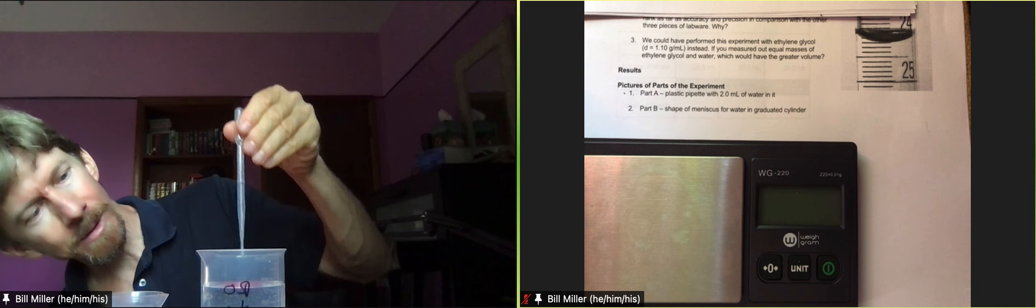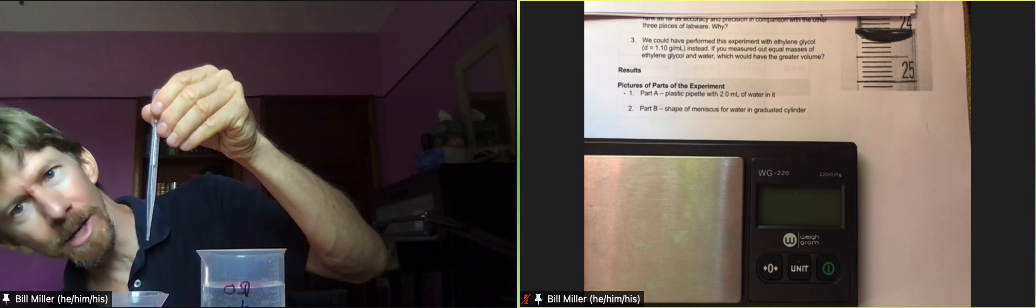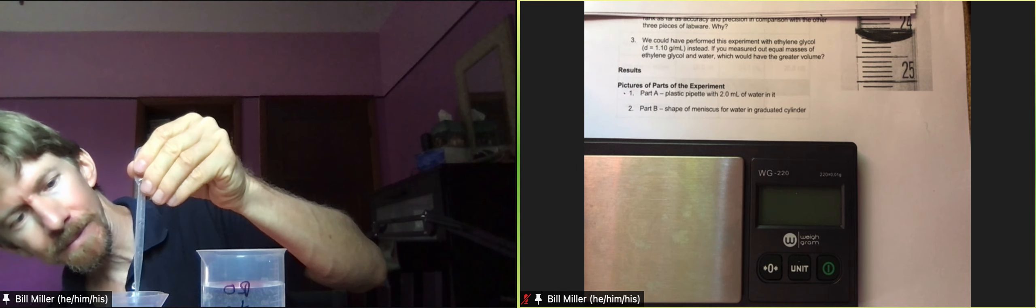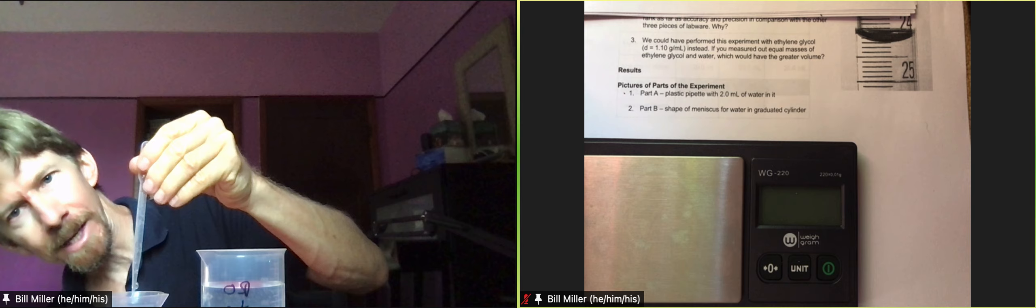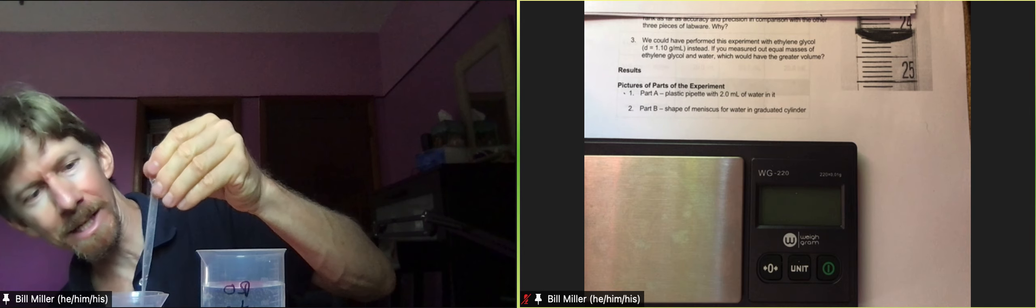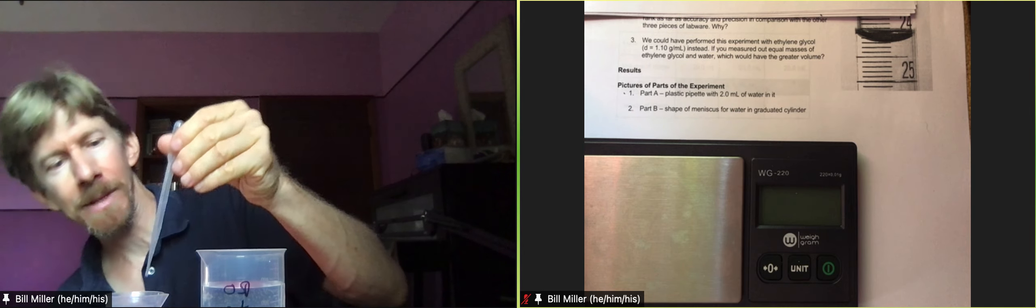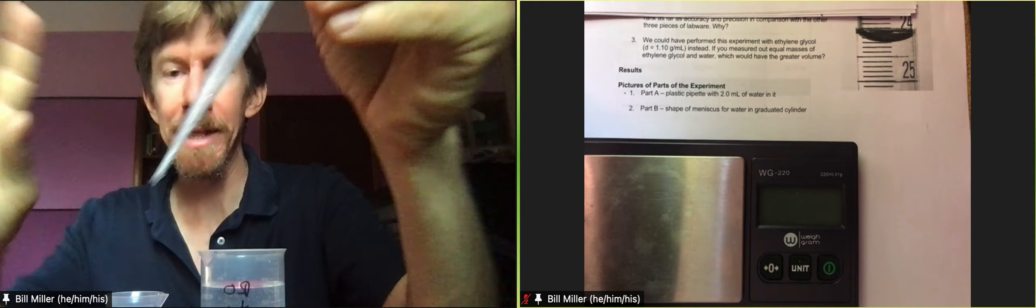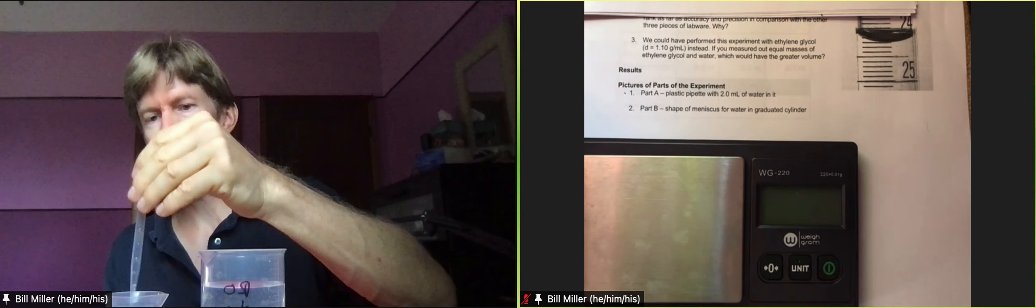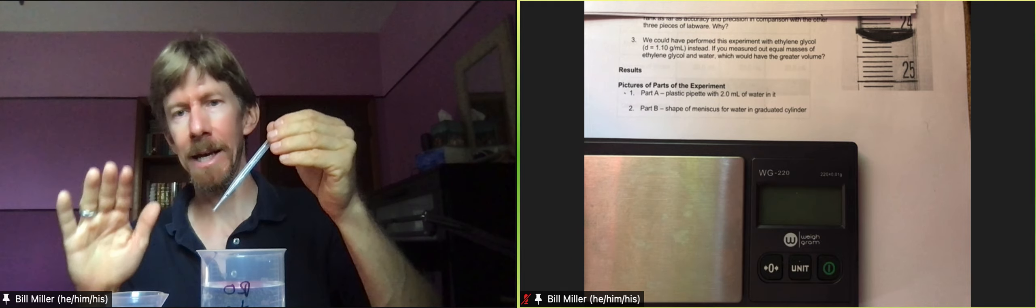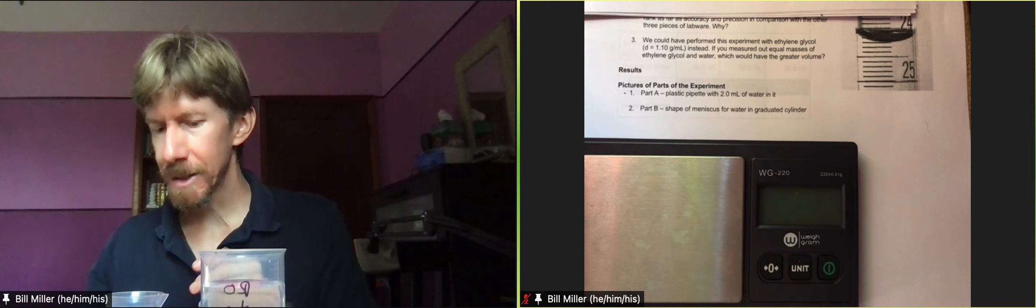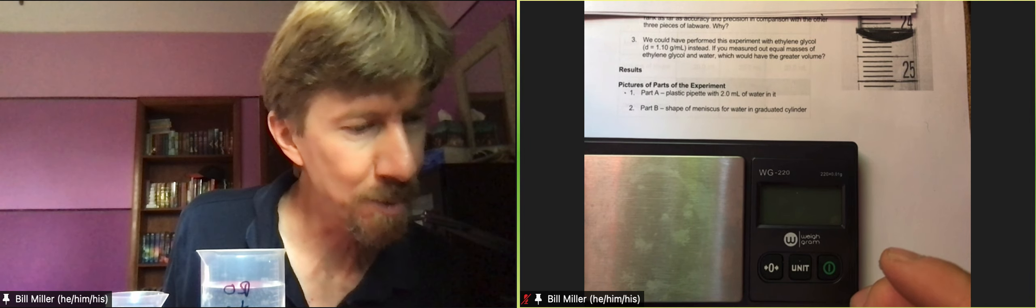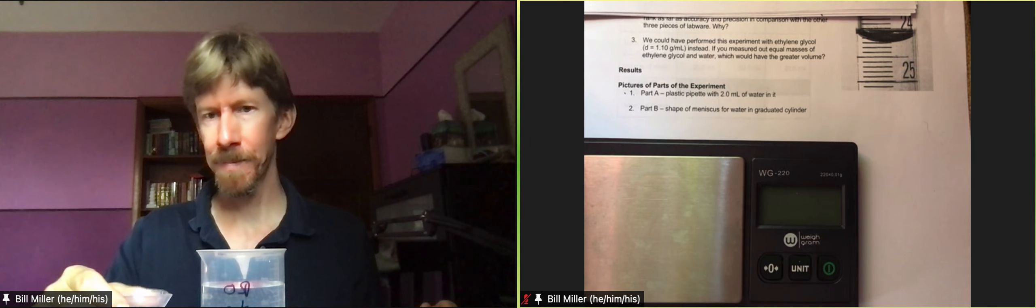You can squeeze it out a couple extra times to get everything out. There may be a drop on the inside in there, that's okay, squeeze it out as much as you can and get everything you can. Let's see how it does, so that is deliver two milliliters, 2.0 milliliters and it doesn't look like very much.